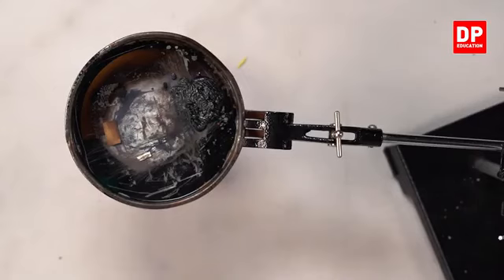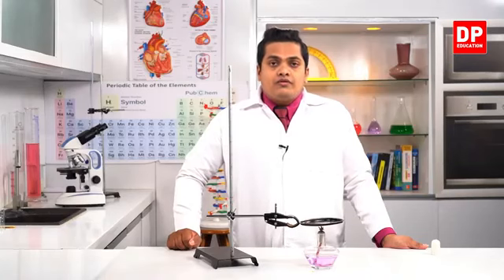The piece of magnesium has the highest ignition temperature. Still the magnesium piece is not burning at all. It is still on the metallic plate, and there is no difference in the color as well. So this is the order of ignition.